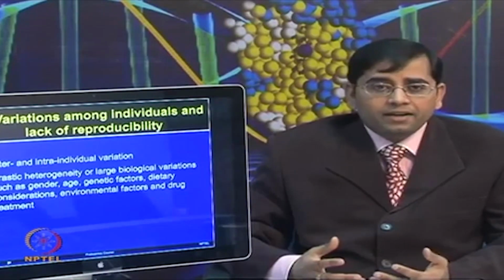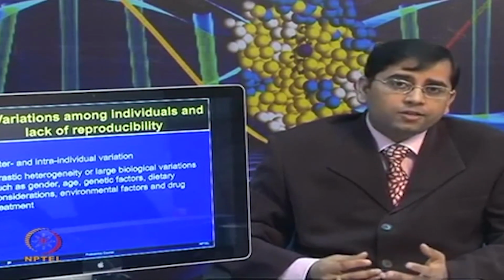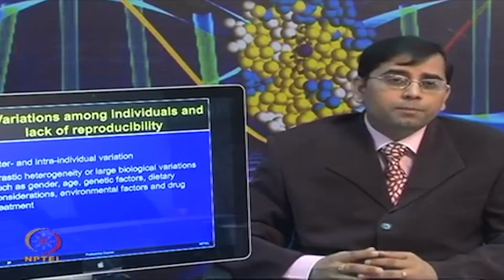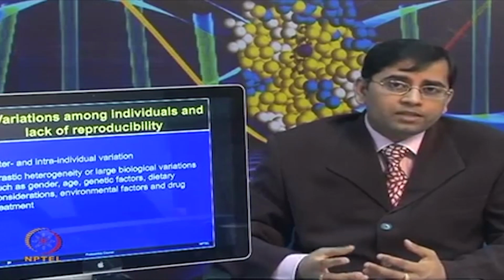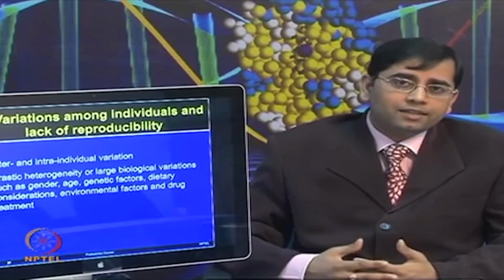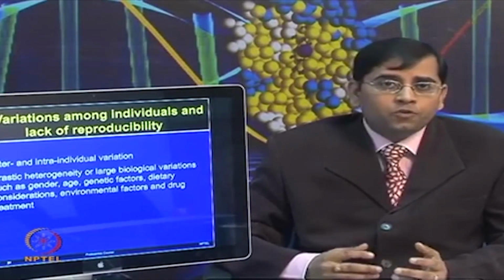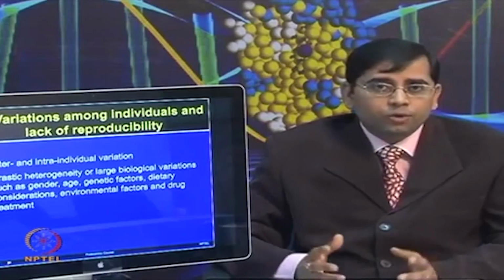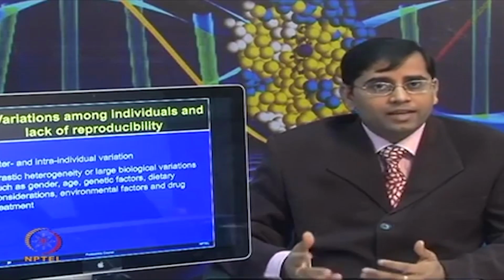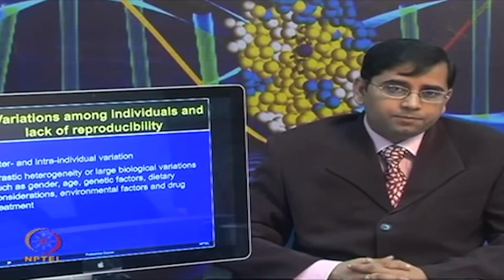So, how to avoid these inter and intra individual variations? If you refer to the previous lecture, when we talked about how to minimize these different types of factors which are going to ensure the success of clinical studies, you will probably be able to keep an eye on different types of extrinsic and intrinsic influences, which one should try to remove as much as one can during the clinical proteomic analysis.